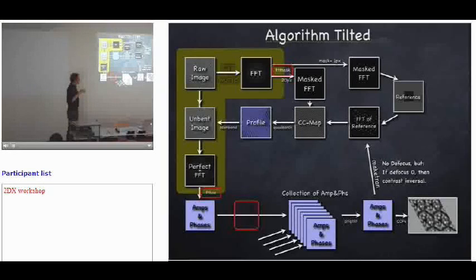And when you merge these together and then want to make a synthetic reference, you have to make this CTF free. So this here should be a MakeTran run without any defocus. If you set the defocus to 0, then no CTF correction is applied, but the contrast then is inverted, so you have to invert it again to make sure that you have the right color of your reference, but that's all implemented. And so this would be the synthetic reference creation with MakeTran in the case of tilted pictures.